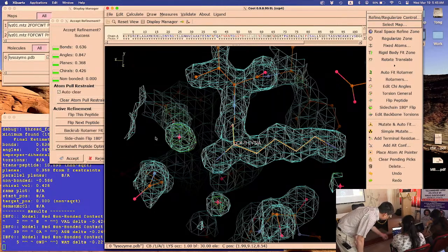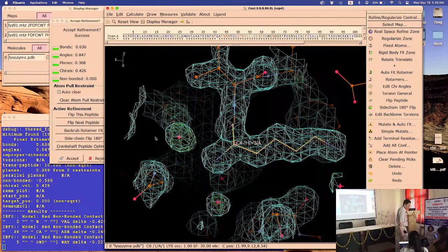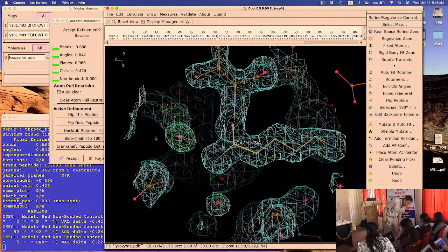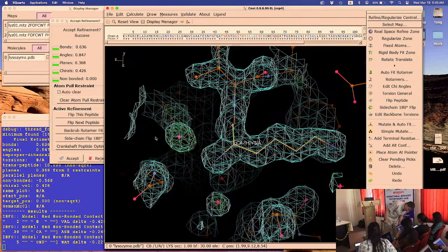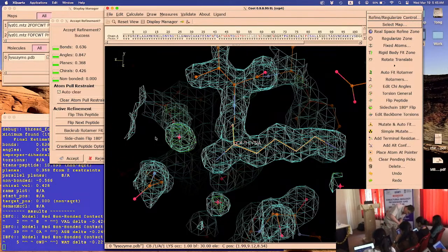Turn this a little bit. Turn. Turn. Yeah, without a mouse it's very hard. Okay. So you're okay? The window unexpectedly closed. Did you build the lysine in? No, sir. I see. Are you on the valine? Closed unexpectedly. No, center on the valine. And then, starting again, right, build the lysine.